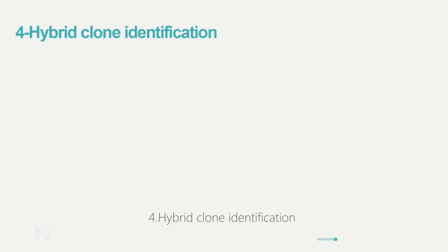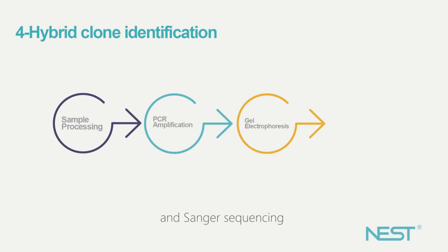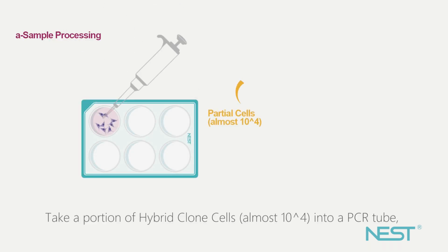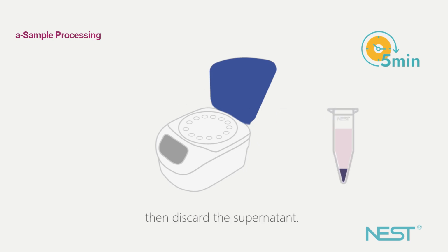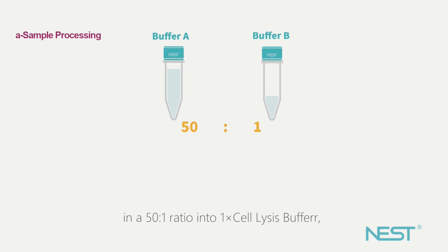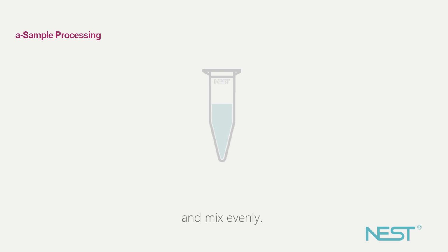Fourth, hybrid clone identification. Hybrid clonal identification includes sample processing, PCR amplification, gel electrophoresis, and Sanger sequencing. Sample processing. Take a portion of hybrid clone cells, almost 10 to the 4th power, into a PCR tube, centrifuge them at 1000 RPM for 5 minutes, then discard the supernatant. Compound buffer A and buffer B in a 50:1 ratio into 1x cell lysis buffer. Then add 20 microliter of 1x cell lysis buffer to the cell sample and mix evenly.